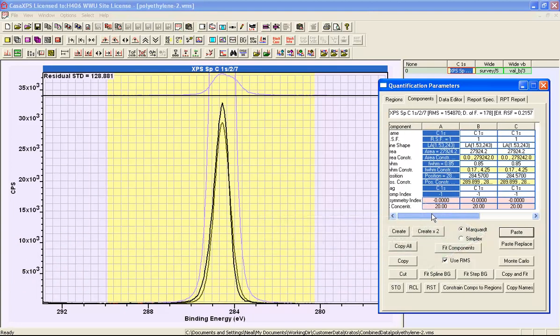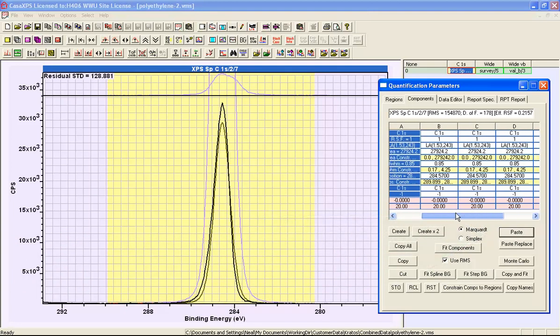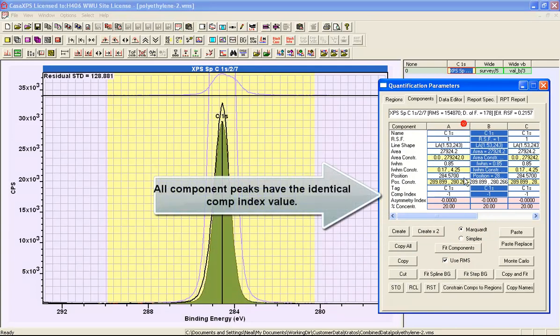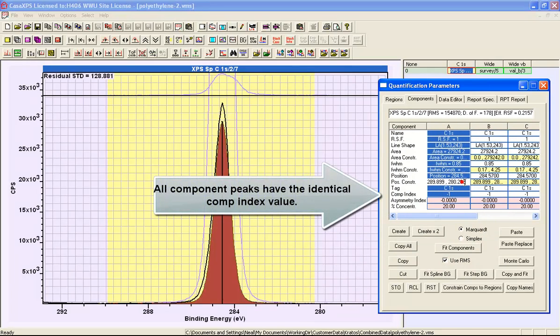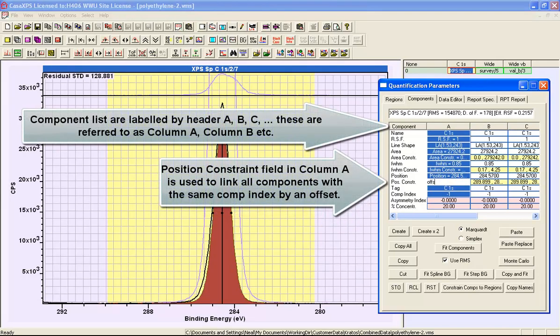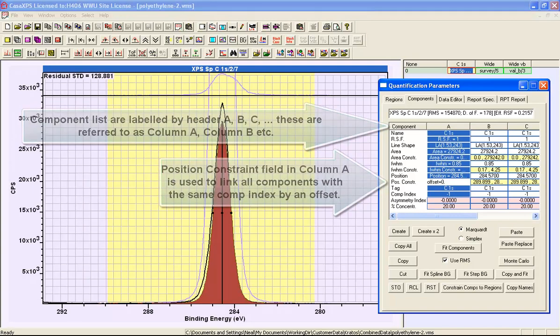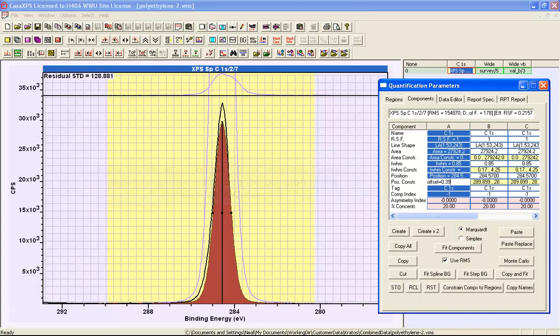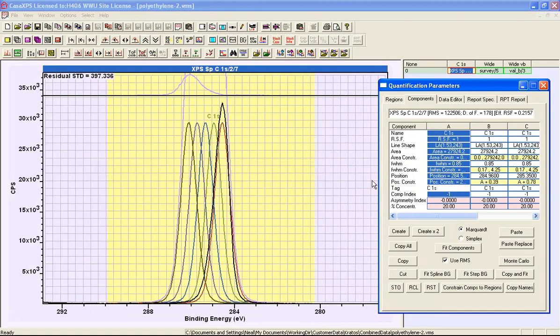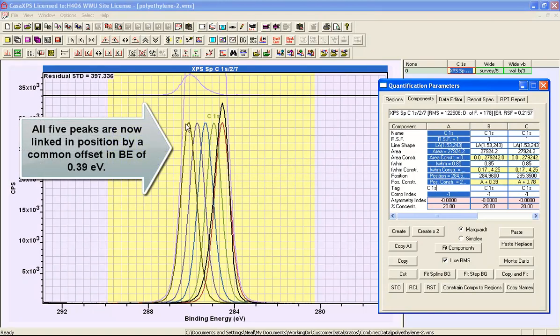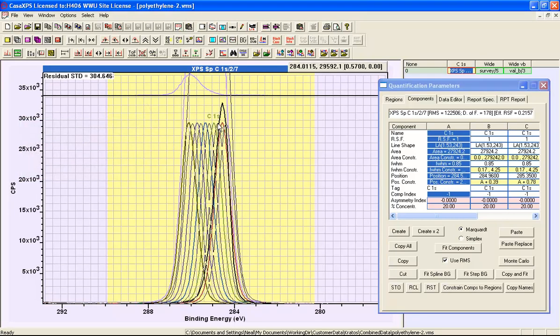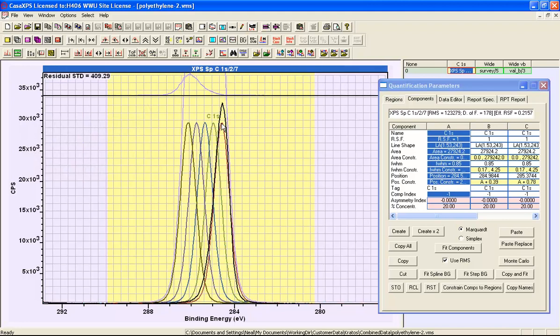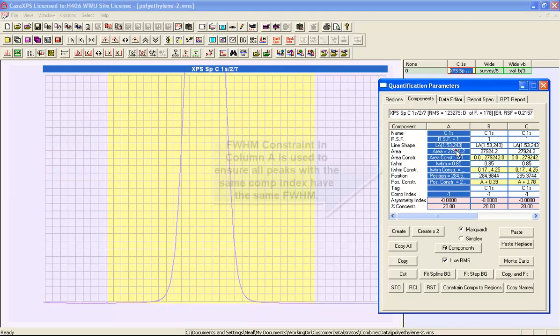These are all of the same size, and we're going to apply an offset. So if we take the position constraint and replace it using a keyword of offset equals, and then 0.39, this represents an offset value that's going to be applied sequentially to all of these peaks one after another. So you can now see that these five peaks have all been assigned a different binding energy and they're all controlled by the first peak that I defined, and that's the one in column A.